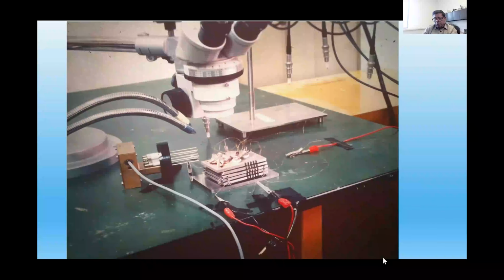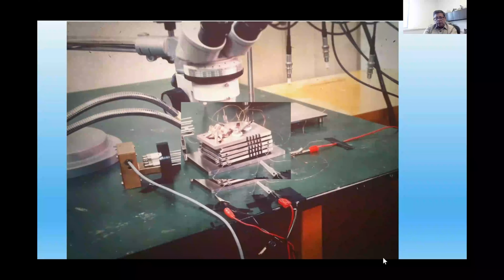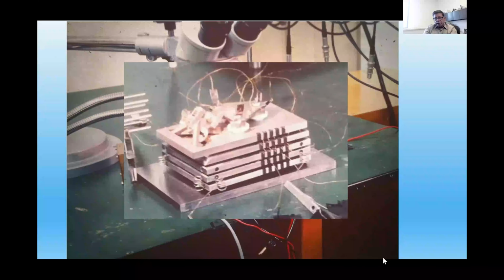I will briefly start with the importance of how there's advancement in AFM technologies. You can see how the AFM looked a long time ago in the 1980s. You see in the picture a few wires connected together. They put together a probe and then a sample, and they tried to physically touch the probe through some nanomanipulation techniques. Out of that, they created basically scanning tunneling microscopes.